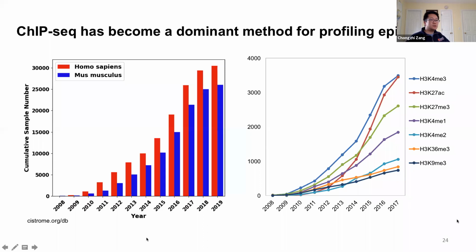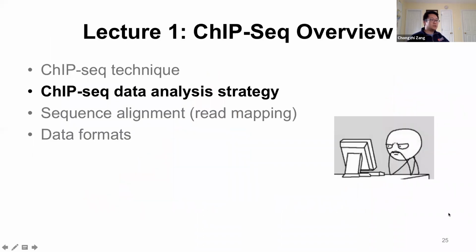So this is some general review of the technology. And next, I'll give you a review about the strategy of ChIP-seq data analysis.